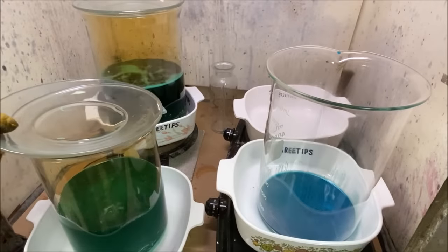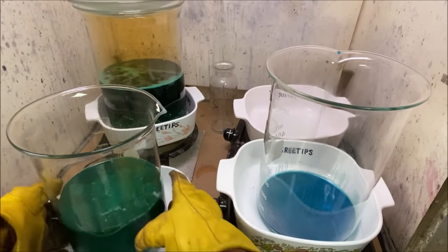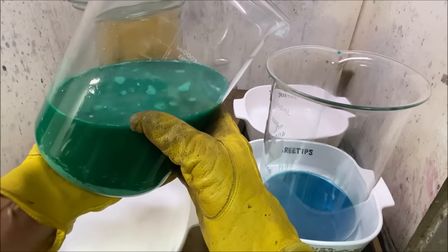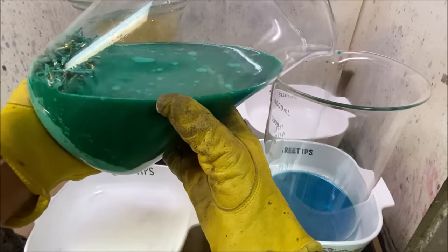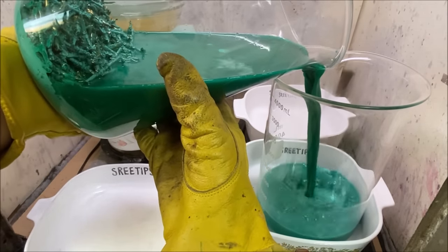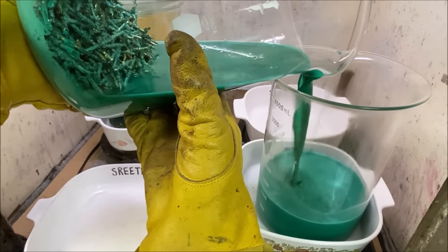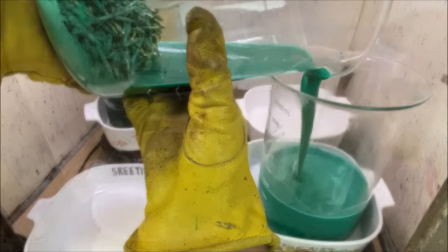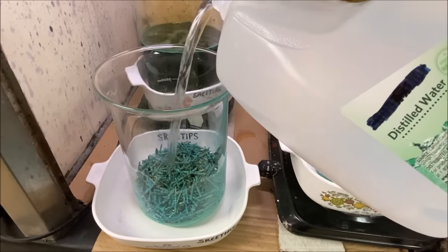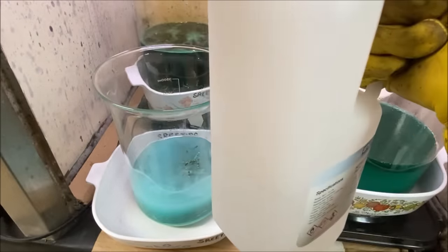It is day two, 3 p.m. It's been 24 hours since I started this project. This is our second beaker. You can see I've got the precipitate forming in this solution as well. And I'm gonna pour it off now into this spare beaker. And we're gonna start adding some solution to these pins to get them moving along. I'm adding some distilled water. Now we're going to add some nitric acid.